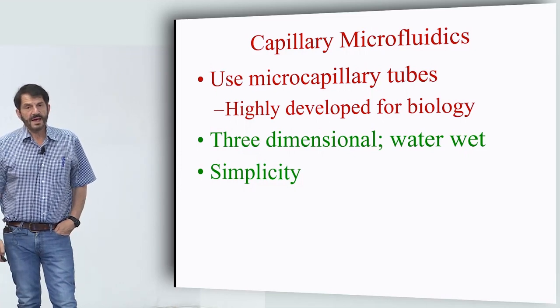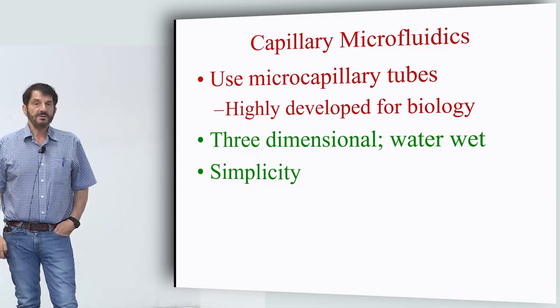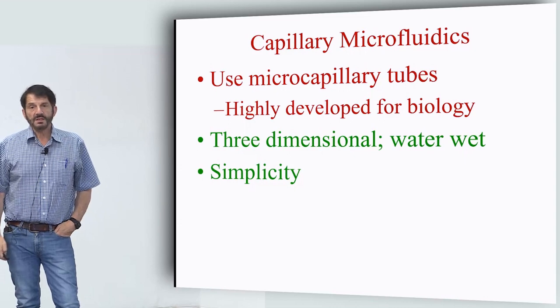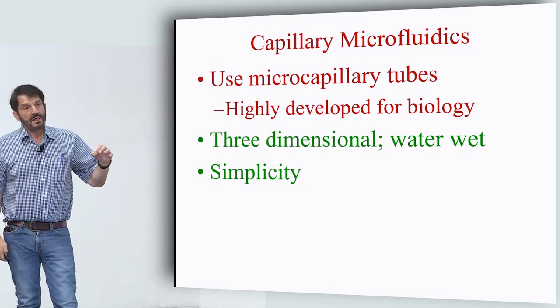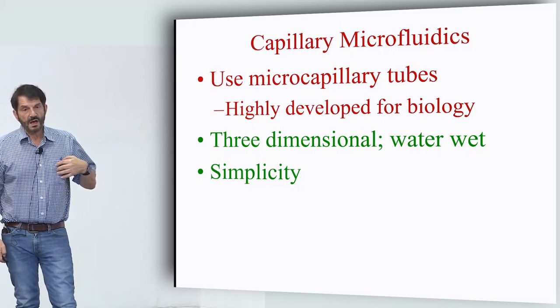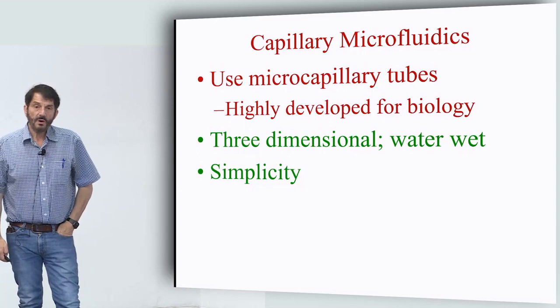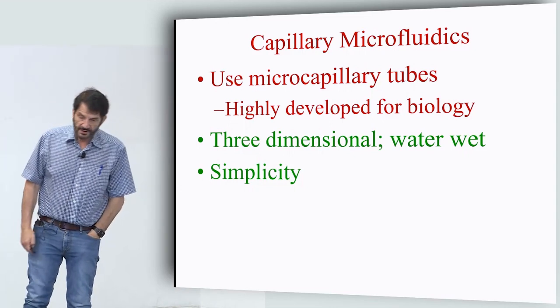But the problem is that it's not very friendly to a lot of different solvents if you want to make new kinds of materials. So we wanted to find something that would mimic the ease of fabrication of the soft lithography PDMS devices, but was more functional in terms of different types of chemicals.